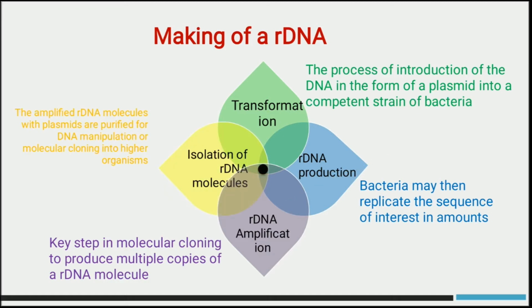So the next step is we can collect the pellets of this bacteria and we can purify the recombinant DNA molecules that contain our gene of interest for transformation purposes in higher organisms or for any experimental requisite. So for this purpose the bacterial transformation is essential for molecular biology.